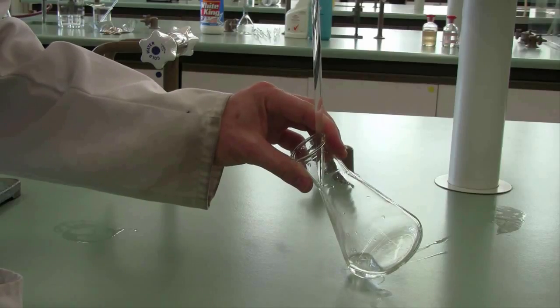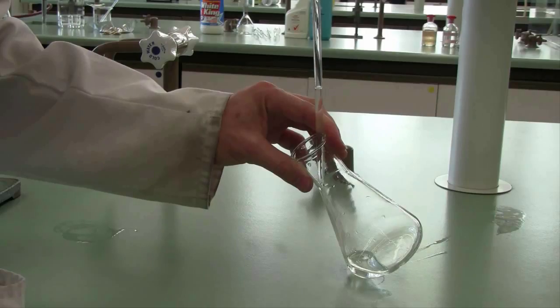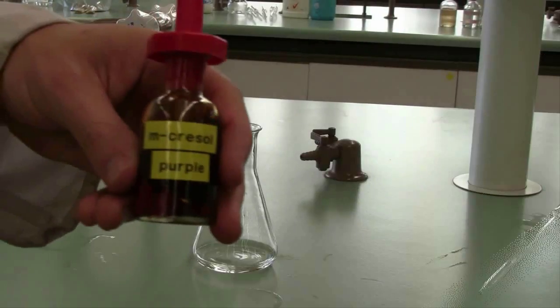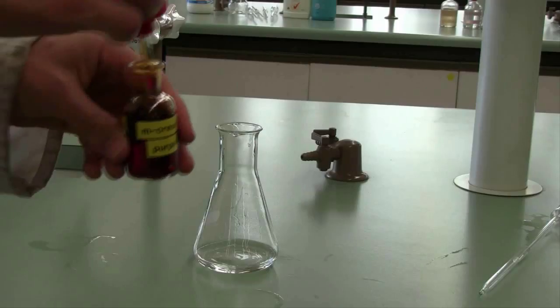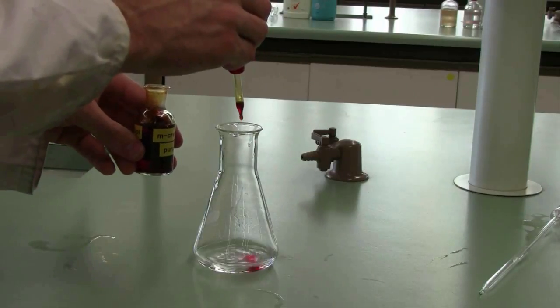First of all, deliver 20 ml aliquots of your acid solution into separate conical flasks. To each conical flask add three drops of metacresol purple indicator, and you'll then titrate each of these solutions to the metacresol purple endpoint.